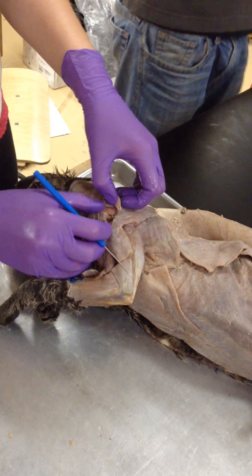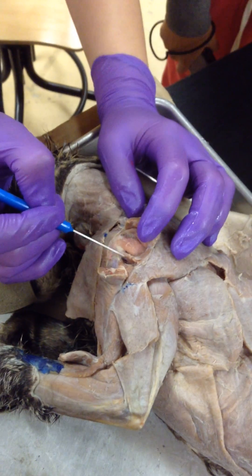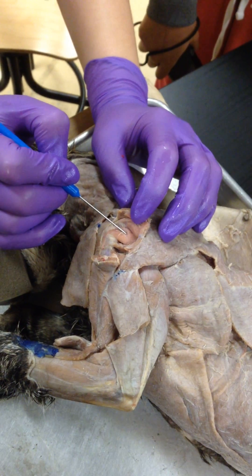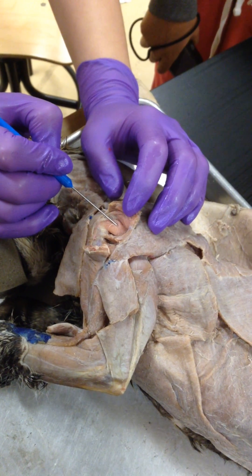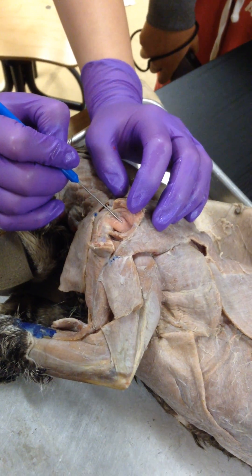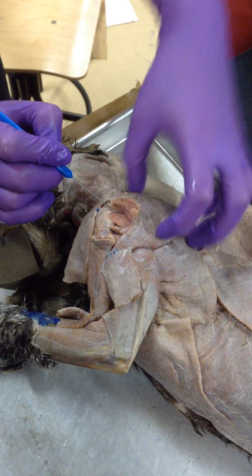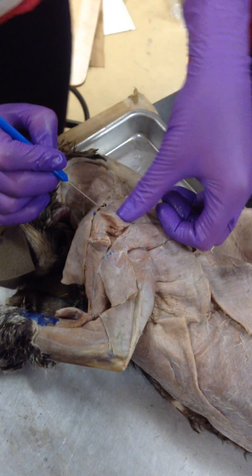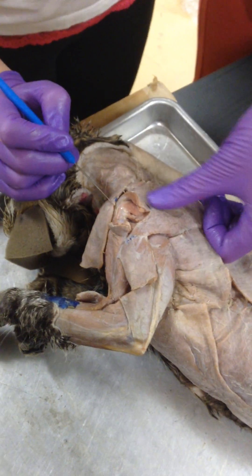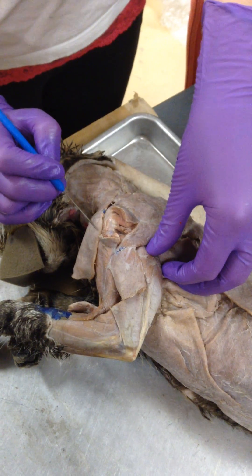Underneath it, you can see your teres minor, this little guy right here. This is your infraspinatus muscle. On your scapula, when you were going over bones, you have your infraspinus fossa and your supraspinus fossa. So this is where your scapula would be. You can see right here is the top of the spine of the scapula. Down here is your infraspinatus muscle attaching to your infraspinus fossa.